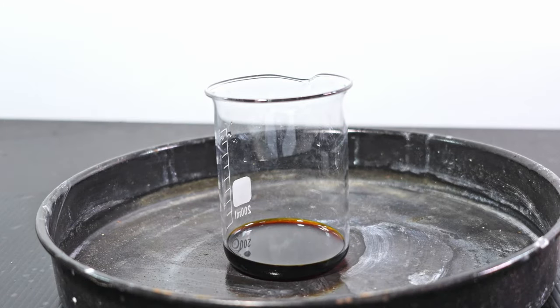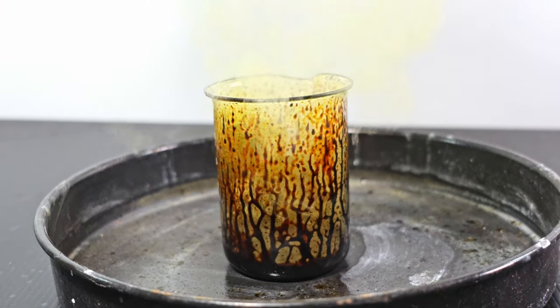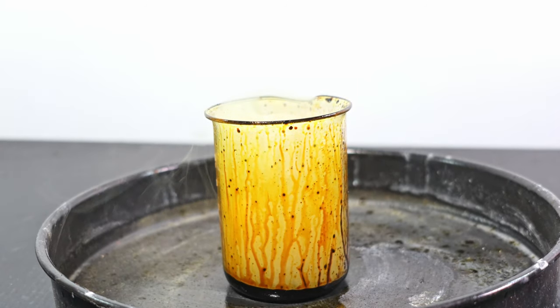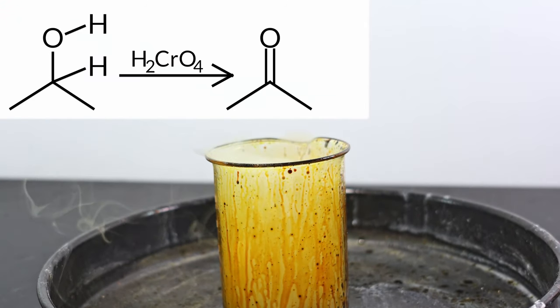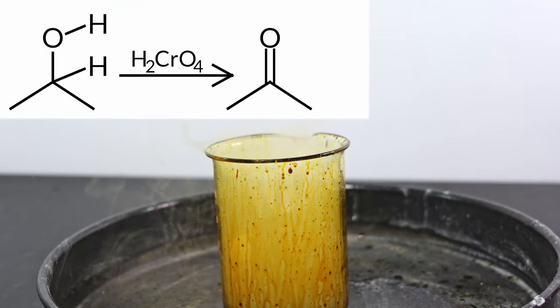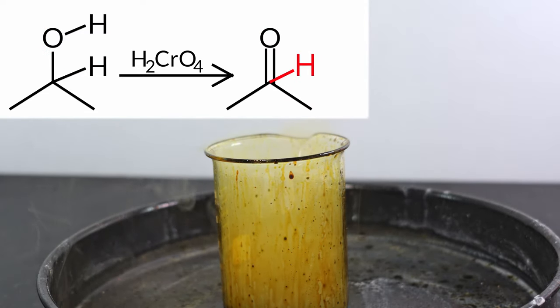For the first test, I'm going to react chromic acid with isopropanol. The reaction happened because the hydroxyl group is susceptible to oxidation. The chromic acid oxidizes the alcohol into acetone. It cannot be oxidized anymore because there are no more hydrogens on the functional group, meaning there are no more hydrogens on the carbon bonded to the oxygen.